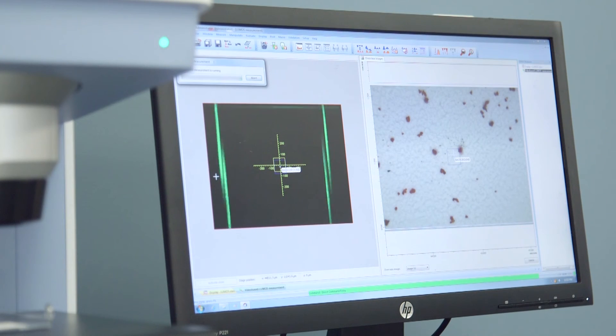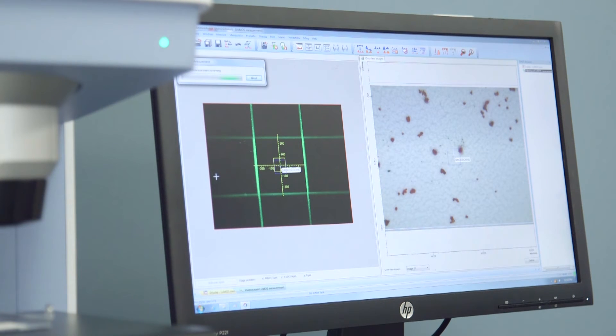Again, no user interference. The aperture blades come into position as well. Using oblique illumination they position themselves. And now I move to defining my measurement positions.